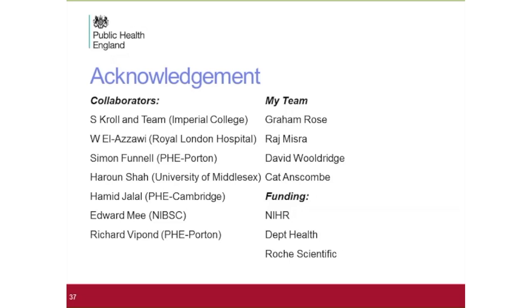That's a really good question, Clotilde. As we are sequencing more and more microbial genomes, we are now annotating them at the same time and characterizing the functional property of each one of these species.